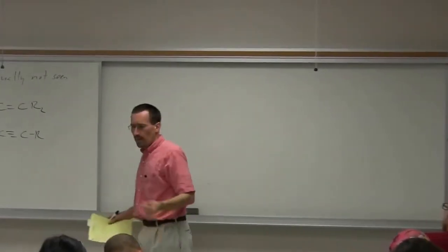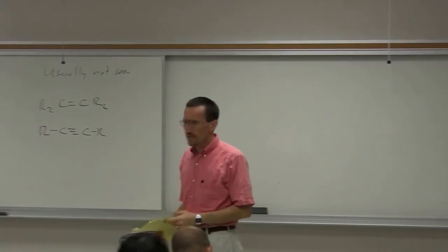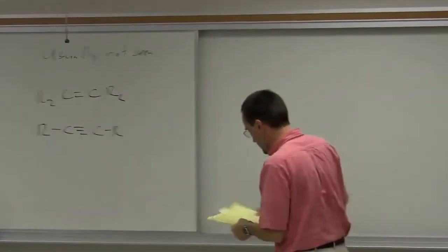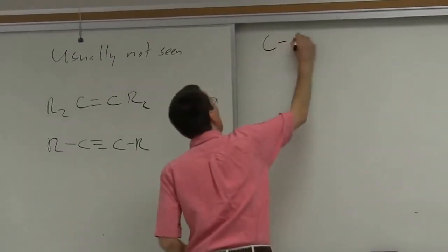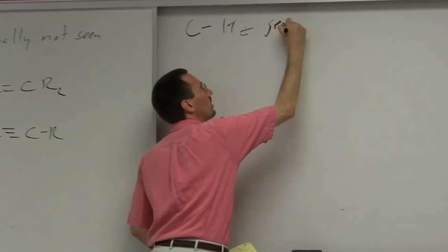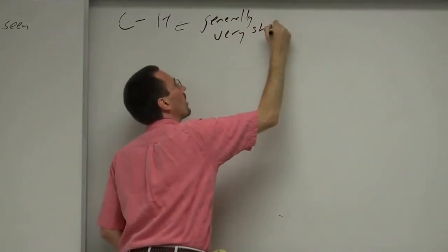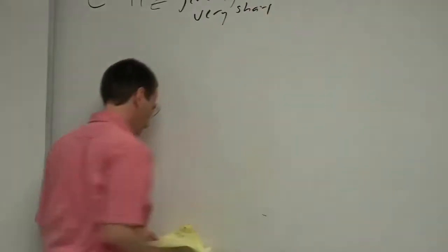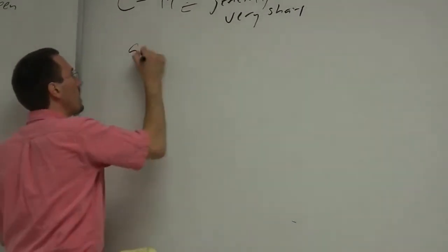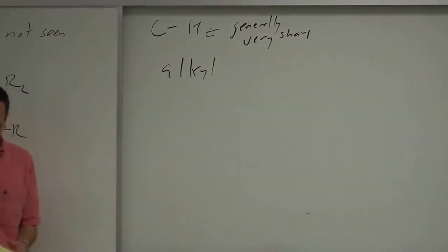We talked a little bit when I was talking about methylene groups, and I talked about the asymmetric stretch and symmetric stretch. We talked a little bit about CH groups. CH stretches are generally very sharp. So things that might clue you in, as I said, alkyl generally not that informative.